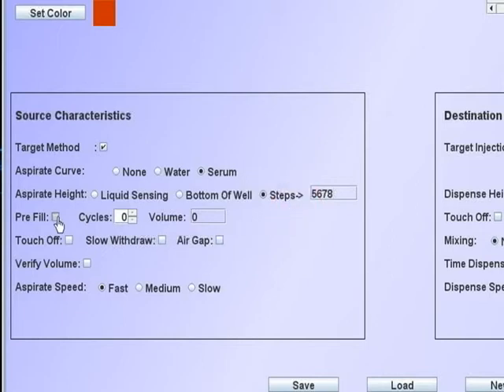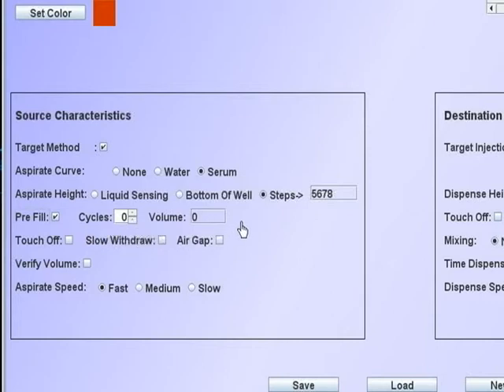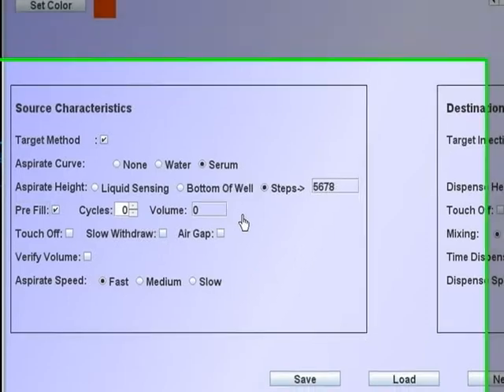The pre-fill function may be used to pre-wet the tip with a defined number of cycles and volume. This function should be used when pipetting organics. When pipetting organics, it is necessary to fill the tip headspace with the organic vapors to prevent dripping.